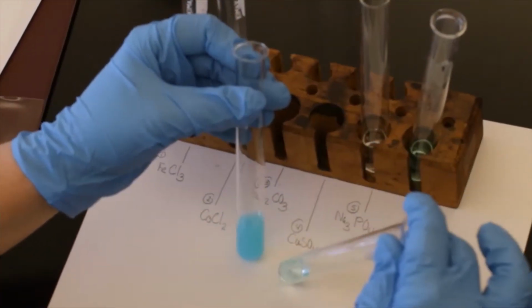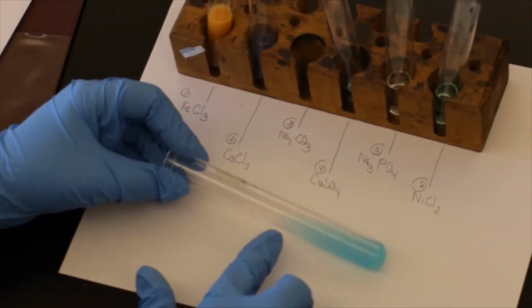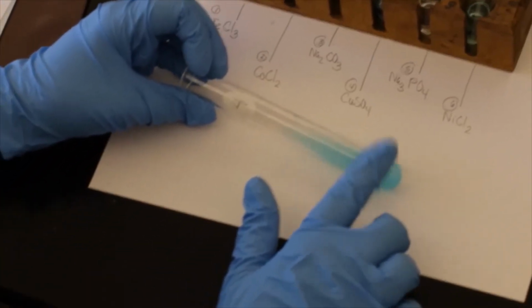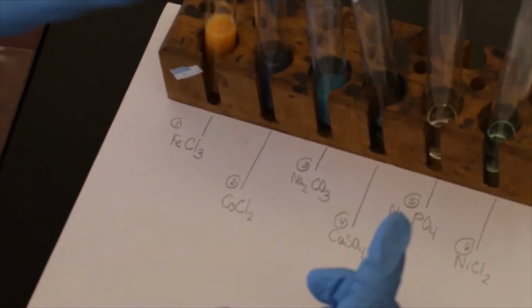And it's brighter than what we started with, okay? And it's a solid. So we formed, again, if you're looking, there's those little blue solid chunks. We formed a blue solid precipitate, and it's a bright blue. Very similar to the precipitate we saw with the cobalt, except this one was purple. So a bright blue solid.